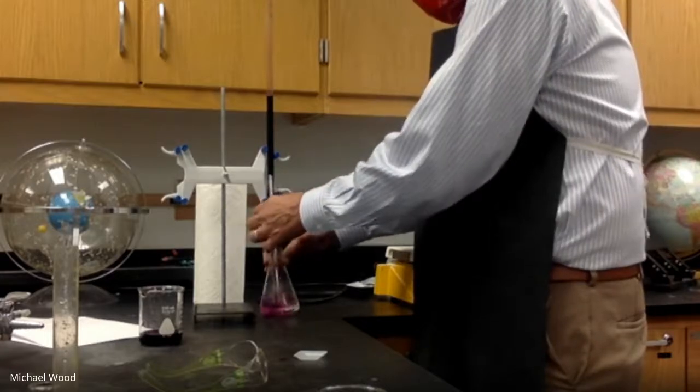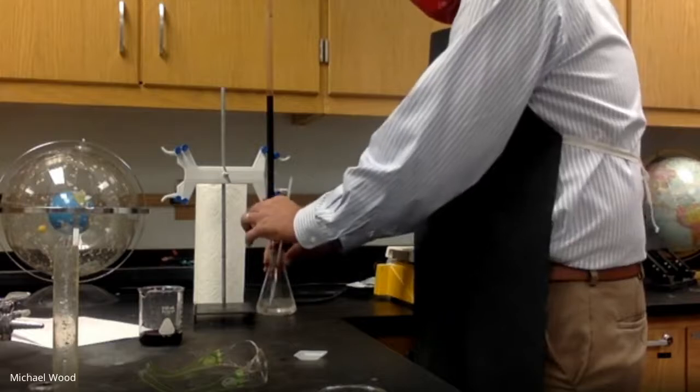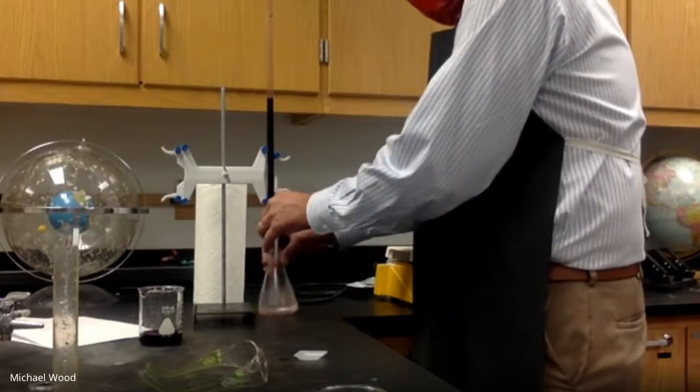This lab, a titration, is one of the most common labs done in all of science.